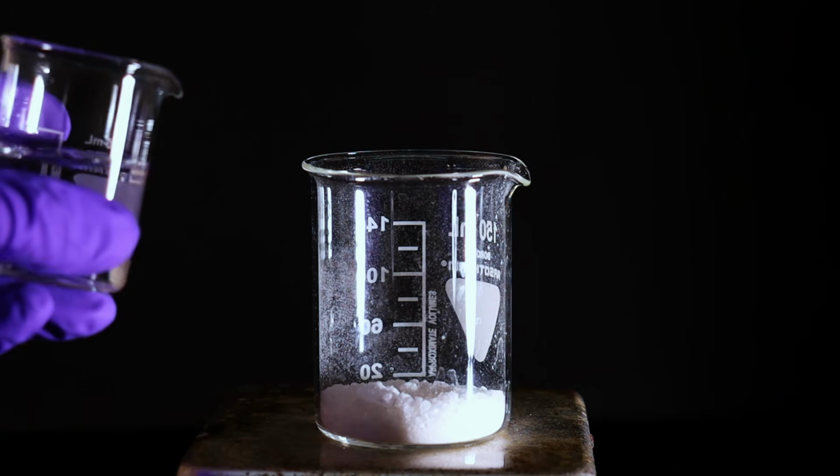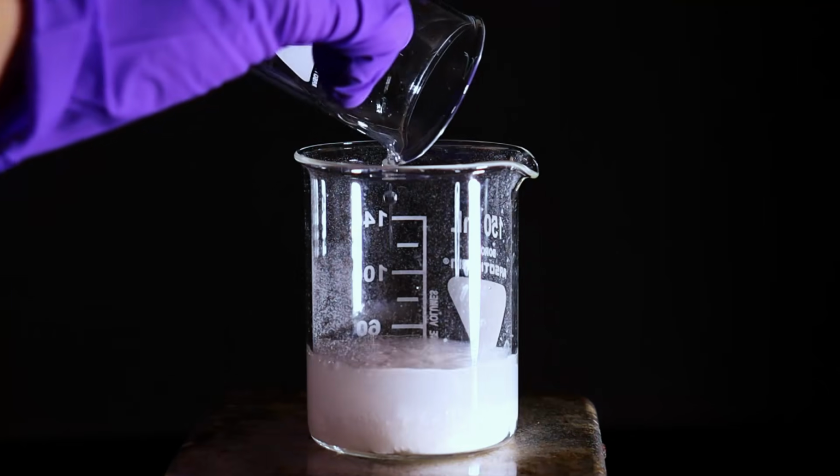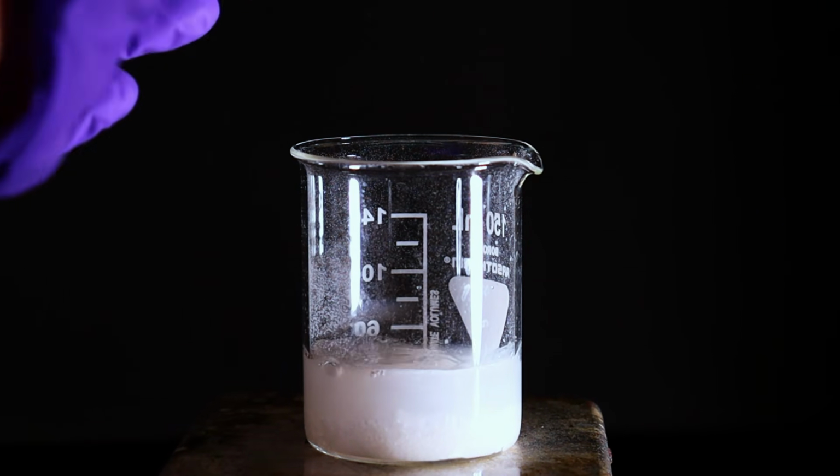You see, I have been working on a much bigger project recently, and for it I needed some phenylhydrazine. Of course, I didn't have it. So in this short video we will be making some for the upcoming grand project. So let's just start with the synthesis.